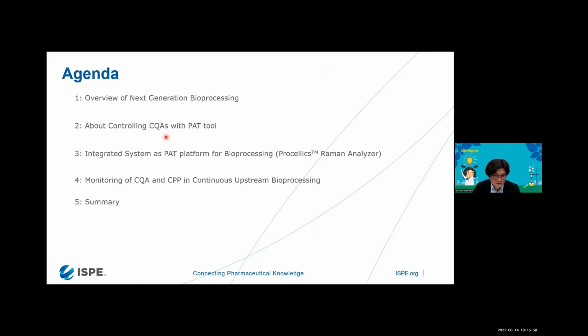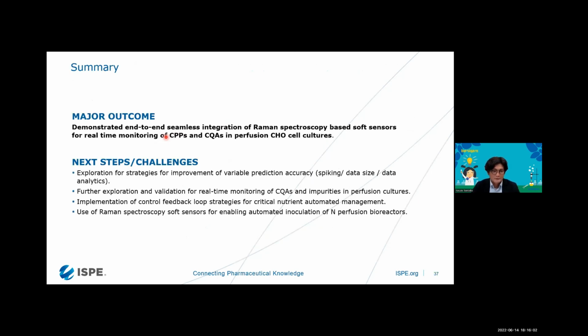So next is the summary. Through our study for the evaluation of the Raman spectroscopy performance, the major outcome is that we demonstrated the end-to-end seamless integration of the Raman spectroscopy based soft sensor for real-time monitoring of the CPPs and CQAs in perfusion CHO cell culture runs.